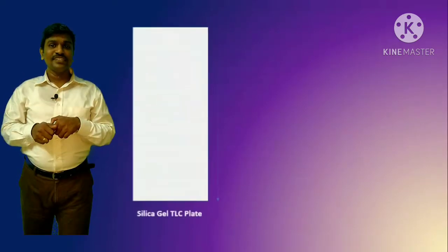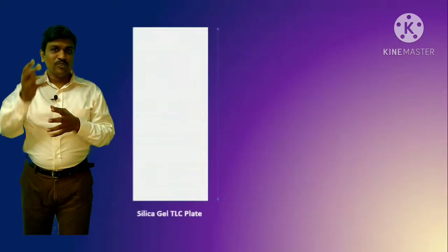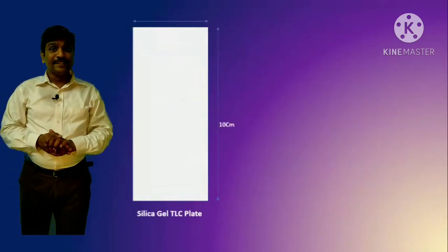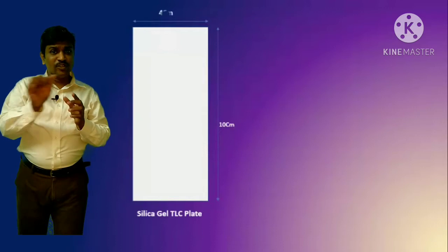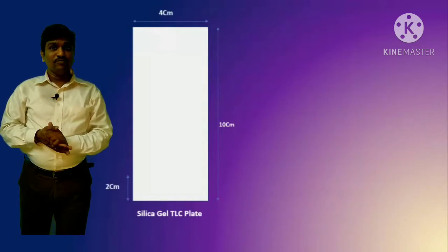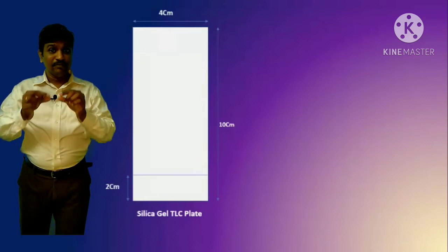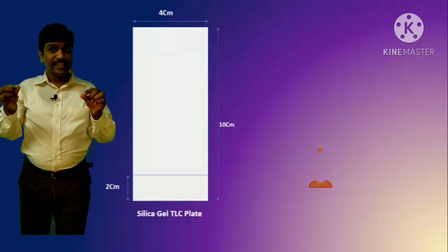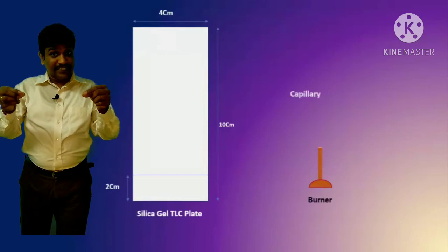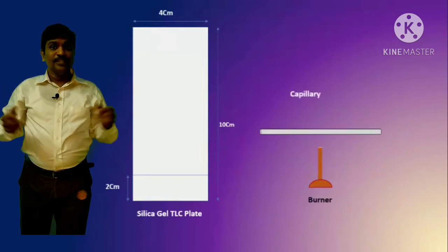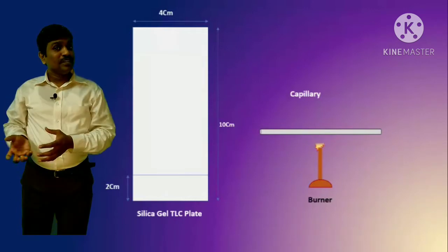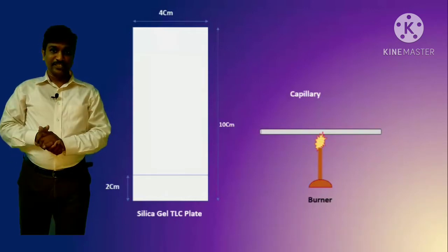The silica gel plate we use is normally 10 cm by 4 cm. Draw the baseline with a pencil — do not use a marker or pen. Prepare the capillary for spotting by burning it at the center until red hot and then pulling it to form a needle shape. Then prepare the mobile phase and keep it for saturation.